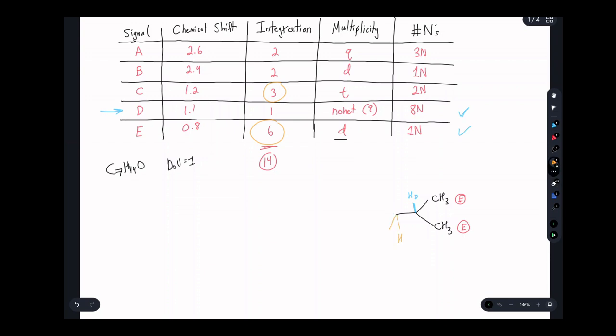And this is the power of the doorway method, right? We keep moving across the molecule, and at this point, look how much of this molecule we've already solved. There were no assumptions up until this step. That's the beauty of starting with this 6 and 3 integration signal. So once again, we've implied the existence of these 2 hydrogens.